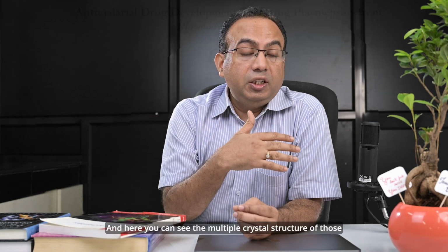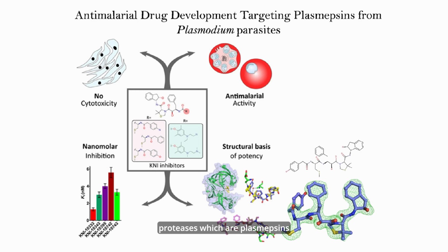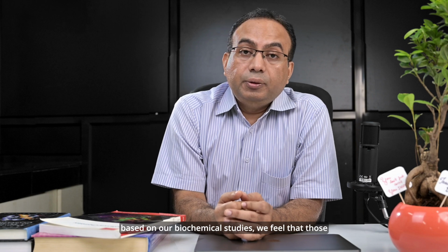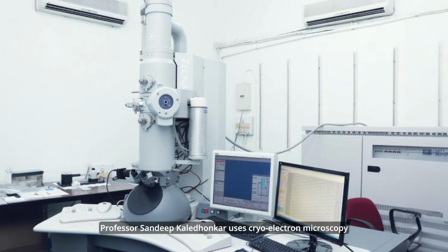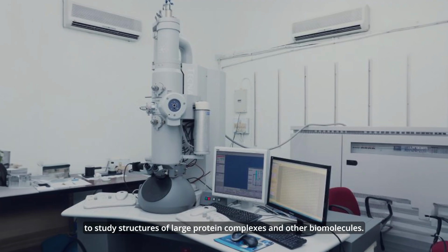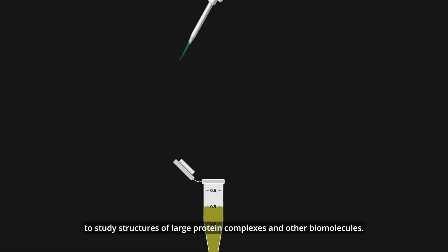And here you can see the multiple crystal structures of those proteases, which are plasmepsins complexed with different inhibitors. And based on our biochemical studies, we feel that those are the compounds which can be developed into antimalarial drugs. Professor Sandip Kaledhonkar uses cryo-electron microscopy to study structures of large protein complexes and other biomolecules.